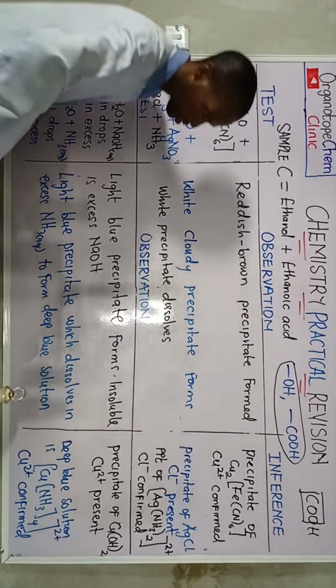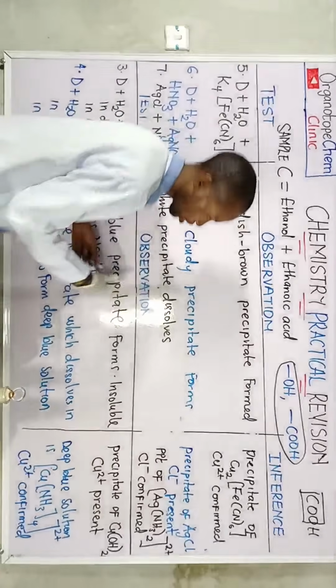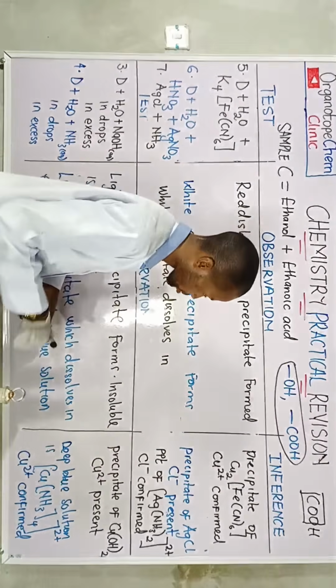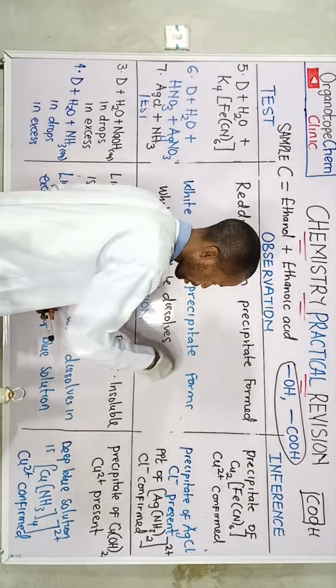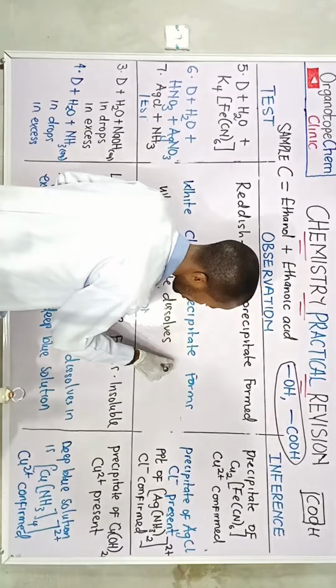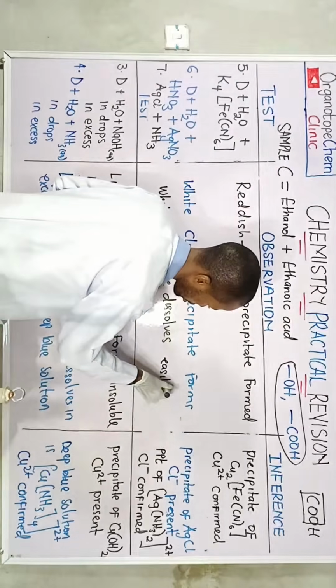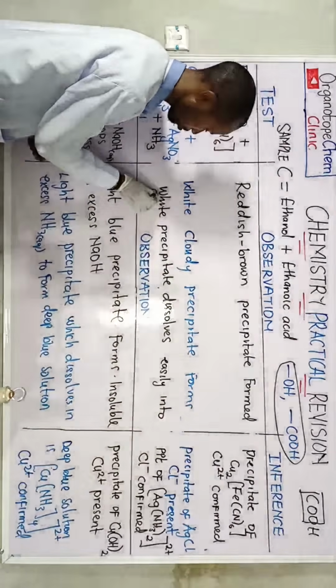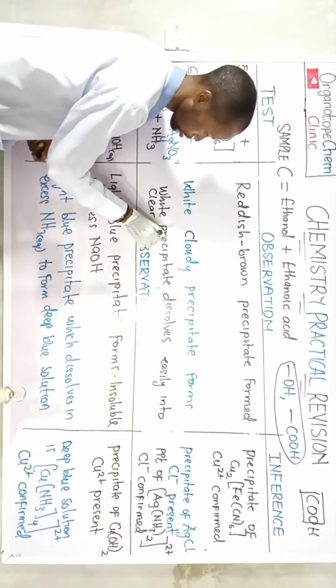So we can add to this, white precipitate dissolves easily into clear solution.